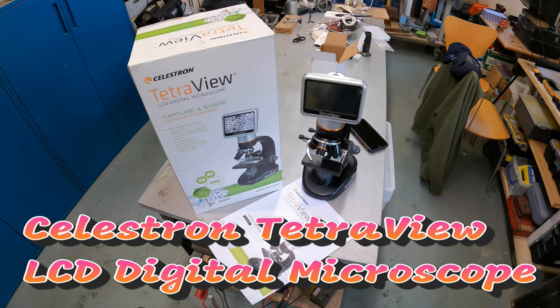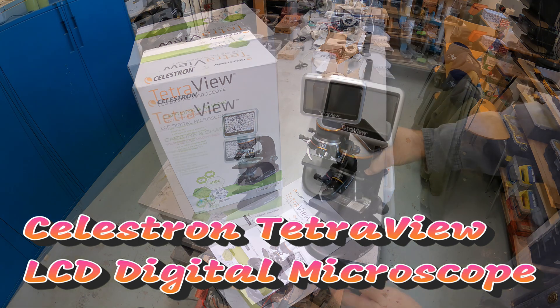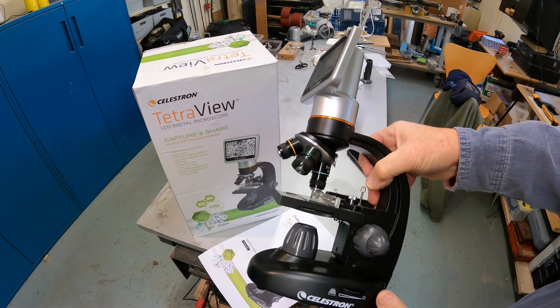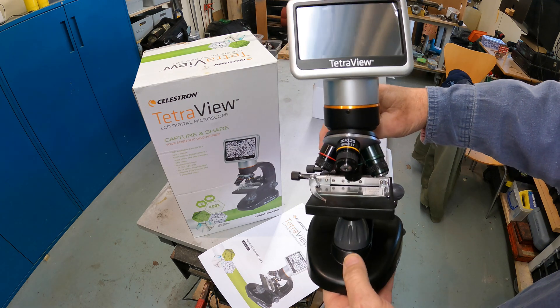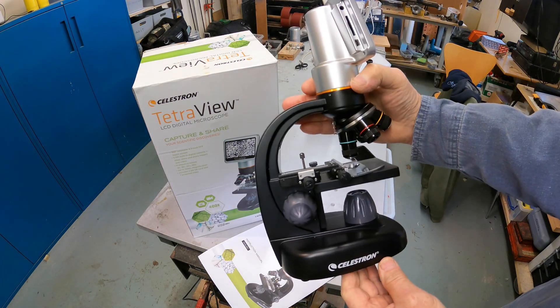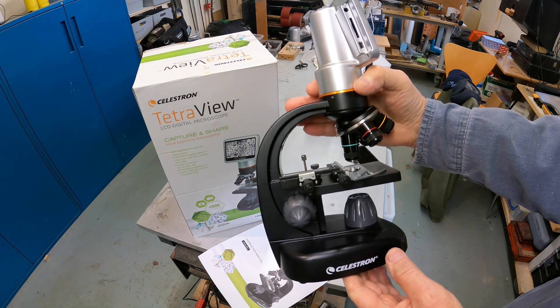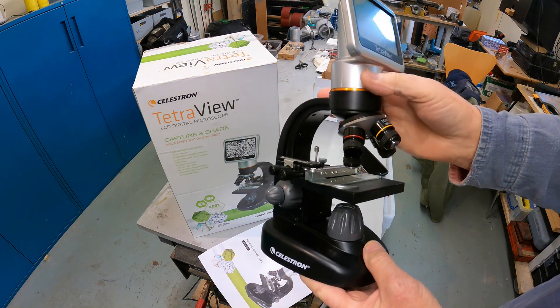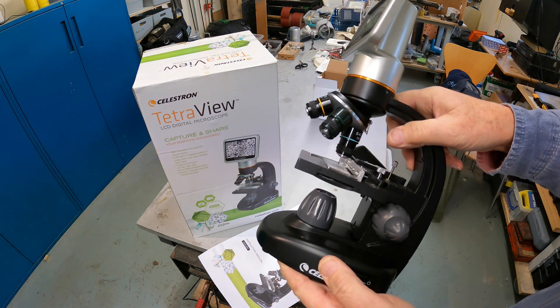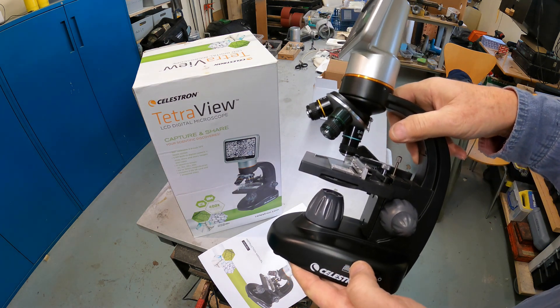This is the Celestron TetraView LCD Digital Microscope, model number 44347. It's beautifully made, very robust. But I've looked on YouTube and tried to find some very basic operating instructions for it and I couldn't find them, so I'm going to do my own.